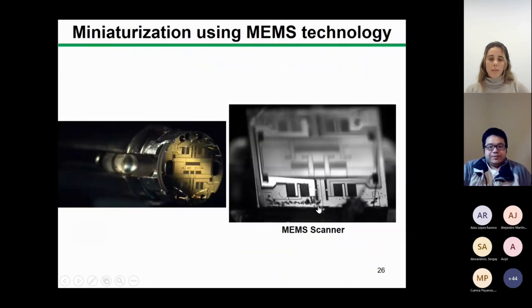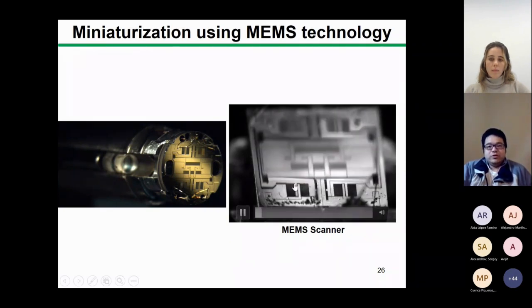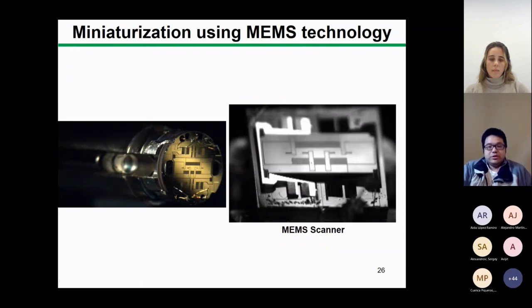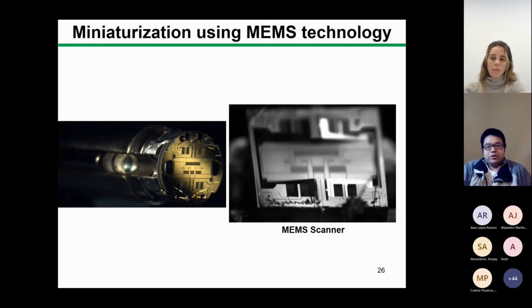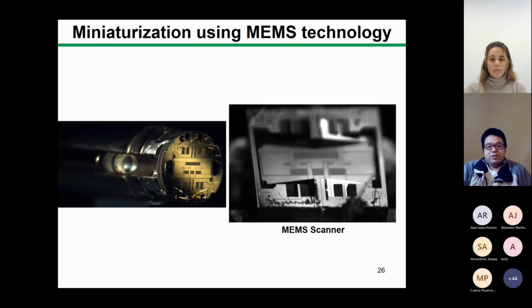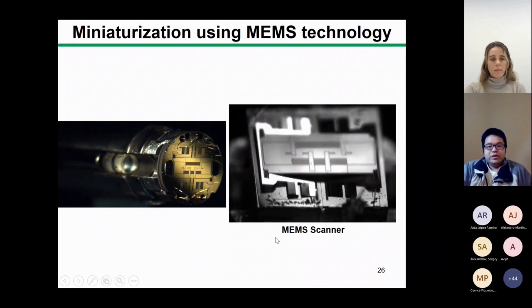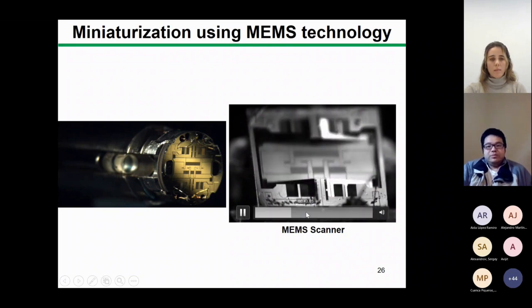And we also developed the XZ scanning, where the scanner can move in the Z direction directly, with this one showing more than 500 microns. That means you can directly scan the cross-section in the Z direction, an XZ scan, which has never been done before in a commercial or even a traditional confocal microscope. But with MEMS, everything is possible in the miniaturized system without the traditional focus tuning. So the MEMS scanner can directly push the beam into the tissue.